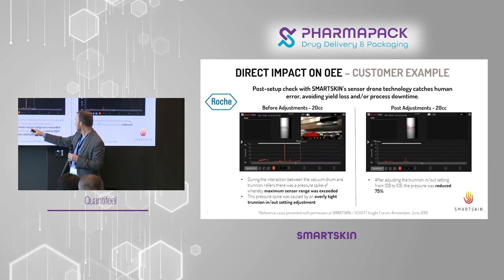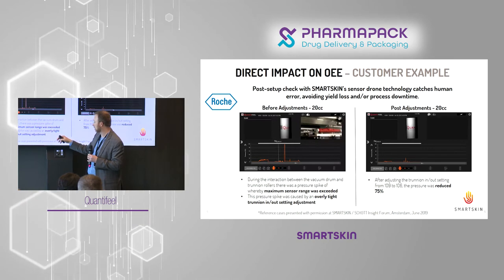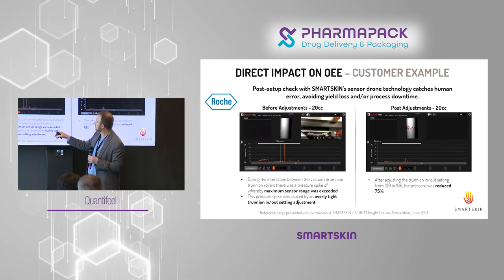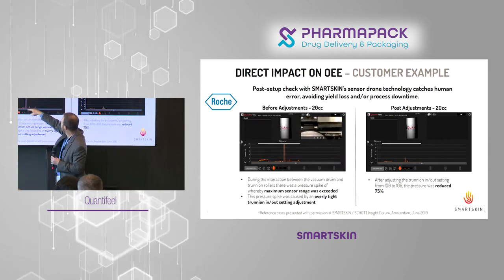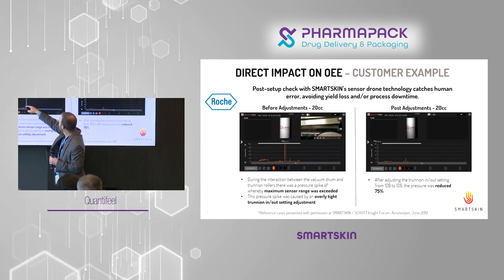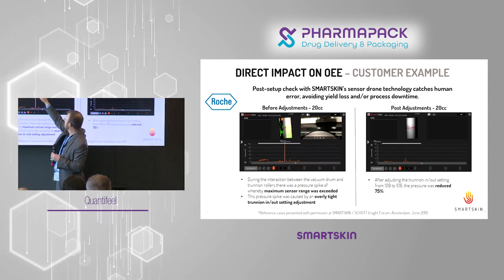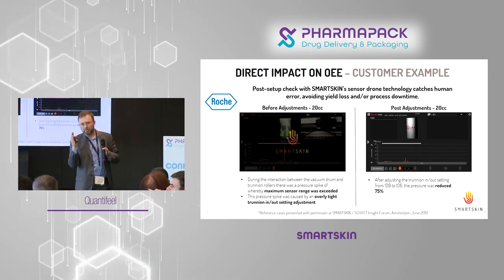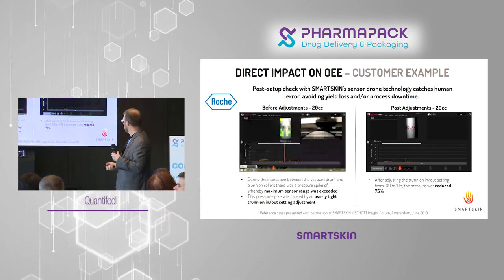Our maximum sensor range was actually exceeded in this video. And what we found is there was an overly tight trunnion adjustment. So you're going to see the video again here. You're going to see this big pressure spike, which we measure, and it's going to stop right here. We're going to reverse it, I think. And then you can come back, and you can see that pressure was exerted all over. So I know it's not an alignment issue of the trunnion. I know those trunnions are too close together, and that's the result.